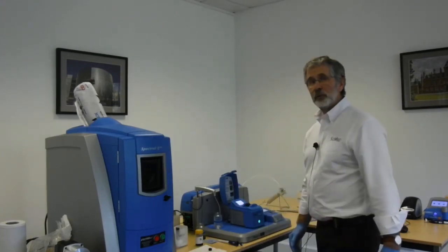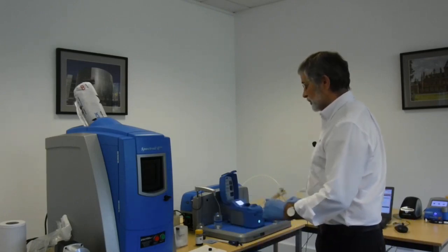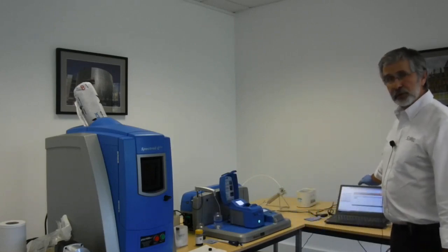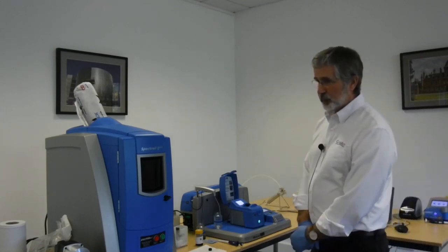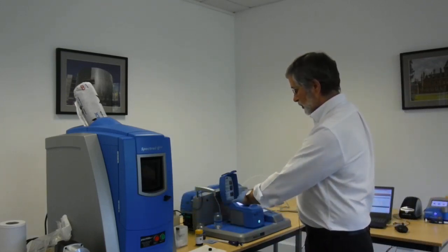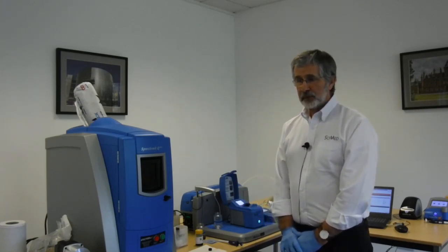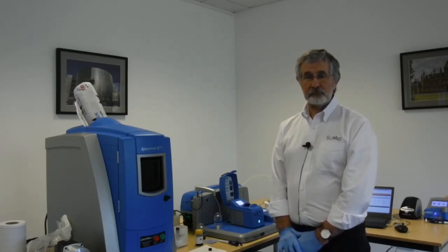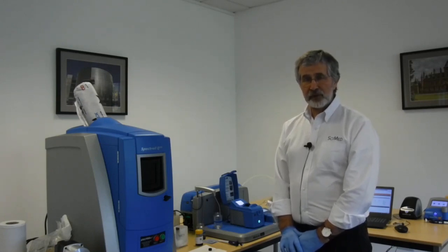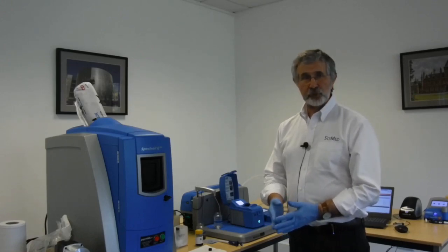So all of those instruments are controlled, and you will see this on a different slide, by 2 software platforms. The platform that actually controls the instruments is called the device console. It's called TrueView, and then the other aspect of it is the archiving database side of it, which is TrueView 360. Now that is available for an off-site manager to schedule analysis, to do all the trending, and that sort of thing. And that is either cloud-based or local server-based, depending on how you are organized in your company.